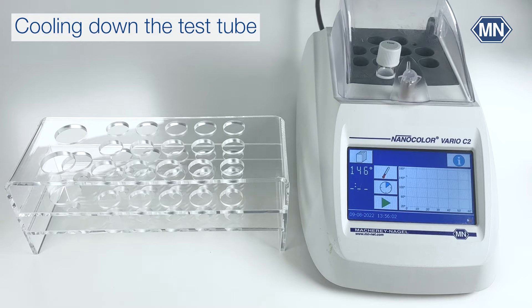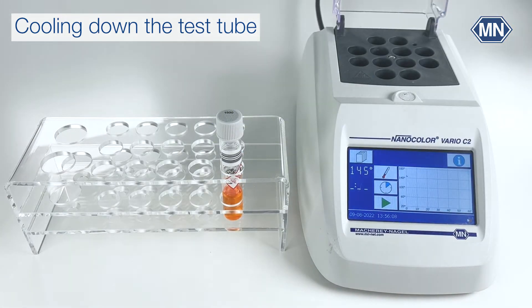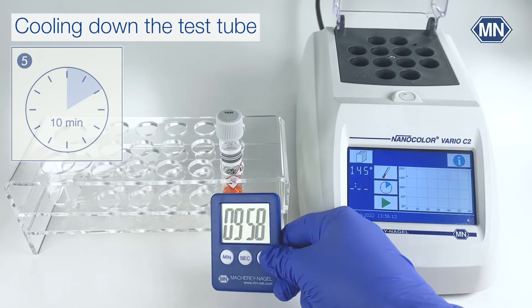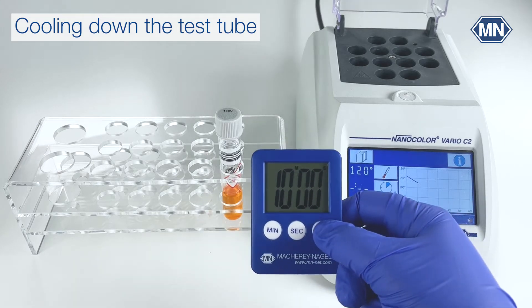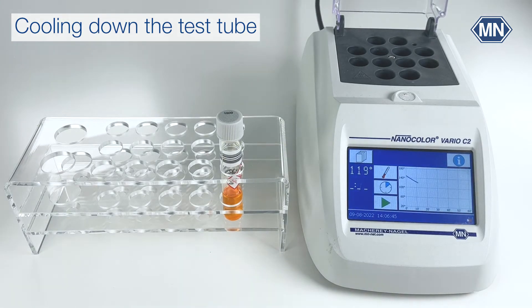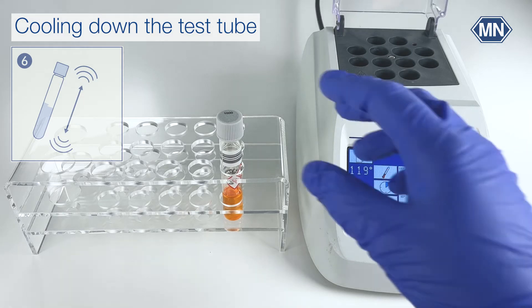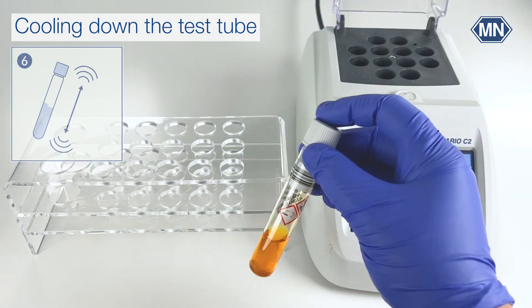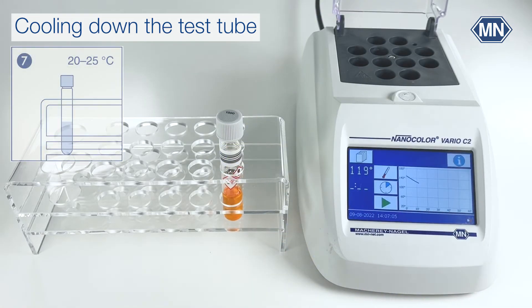After the heating process, take out the hot test tube, place it into a cuvette holder, and wait for 10 minutes. After 10 minutes, take the cuvette — which is still warm — and shake it gently to get a homogeneous mixture without condensation. It is sufficient to shake it only once. Place the COD test tube back into the cuvette holder and let it cool down to room temperature.